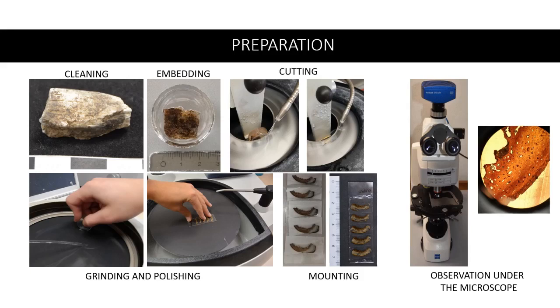on the preservation state. For example, fragile bones, such as cremated, are best left a bit thicker and then thinned later with grinding. It is best to cut the samples with a slow diamond saw equipped with a cooling system, which prevents overheating and damage. For each sample, around 5 sections are recommended in order to have more in case some damage occurs during later steps or if the structure is not well visible.